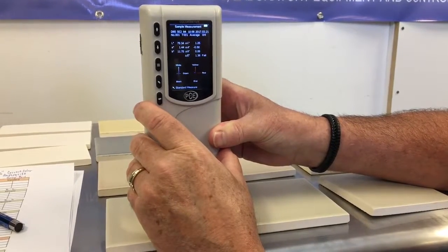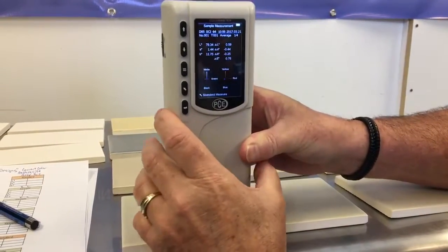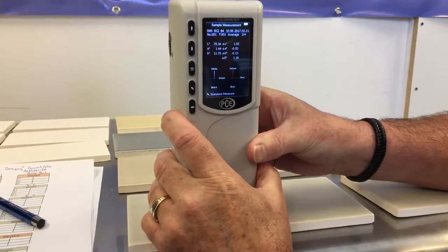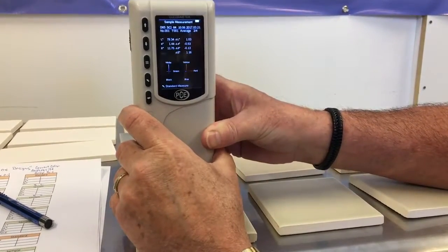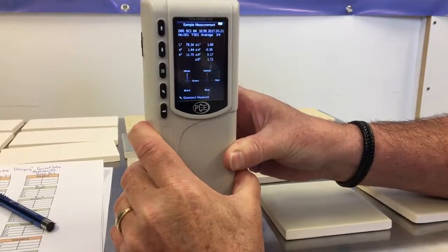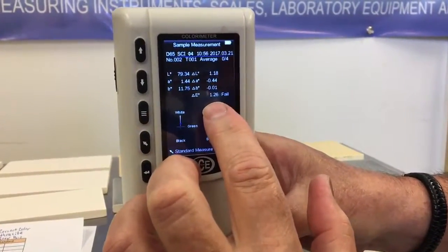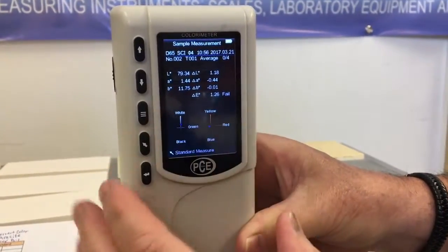Now we're ready to check sample two — one, two, three, and four. We can see that delta E failed on this color by 1.26 from our standard.